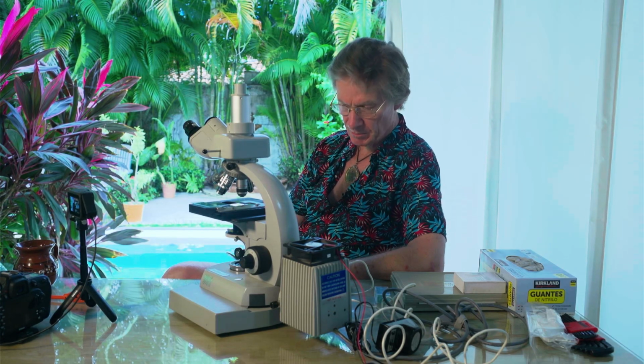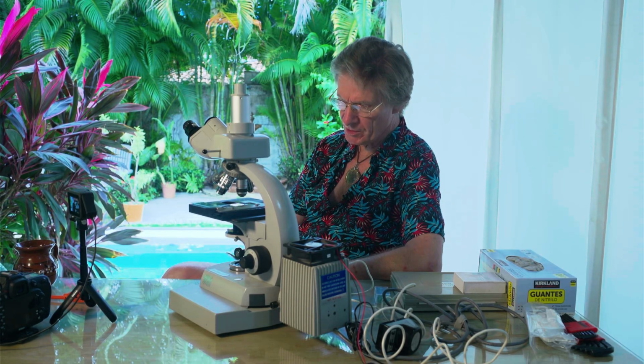And the reason I talk about this in the course is that there are numerous practitioners or instructors in live blood analysis that unfortunately don't know these concepts the way I do and teach that some of these artifacts are actually part of the sample and are indicating a certain disease pattern in the person that donated the blood sample.